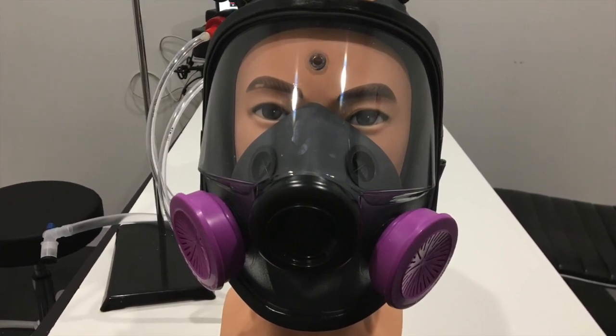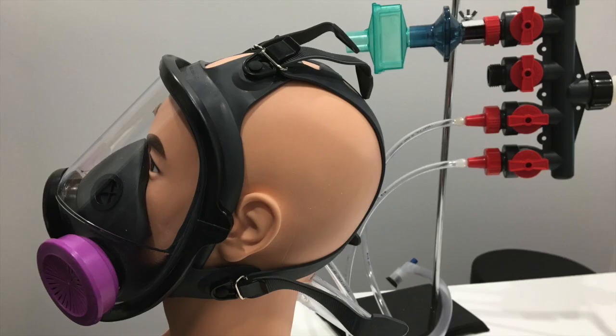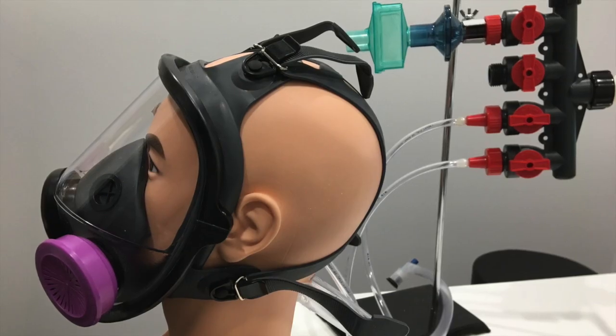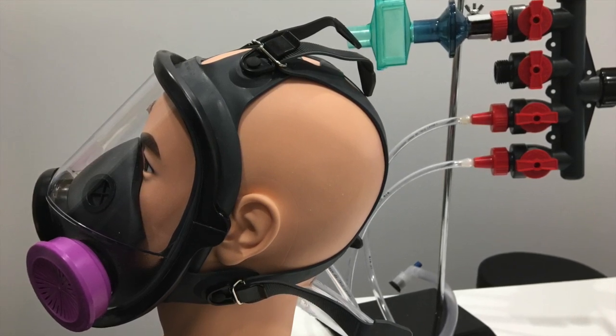It has two P100 filters on it. The nice thing about this mask is it has some nice pull straps — you can see here on the side view — and there are four of them: one for each side, and for the top and the bottom.